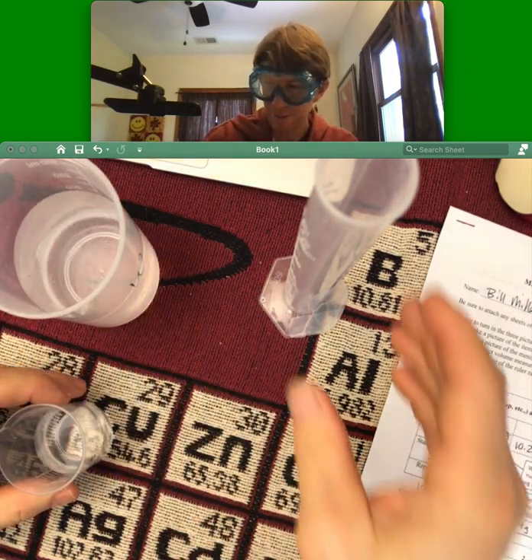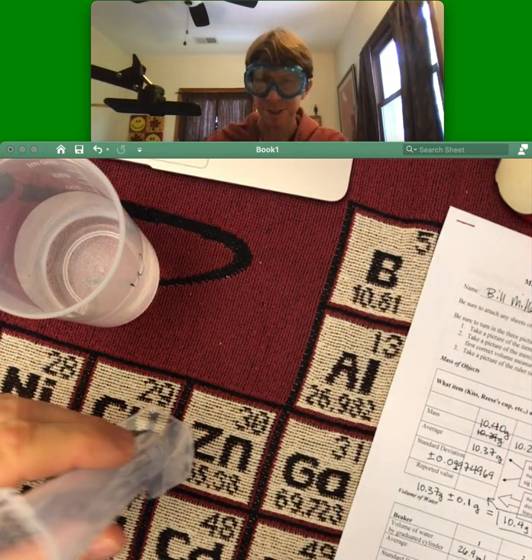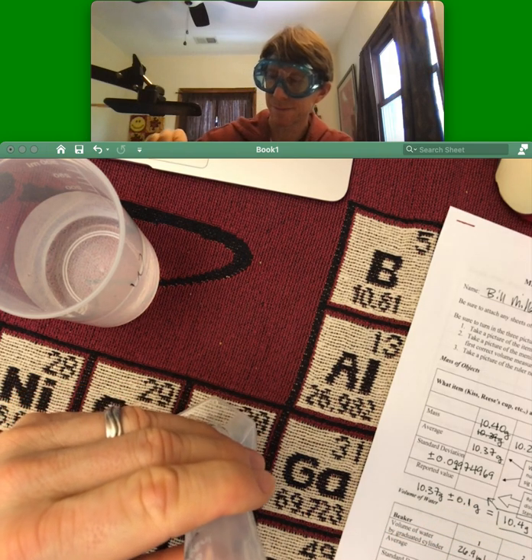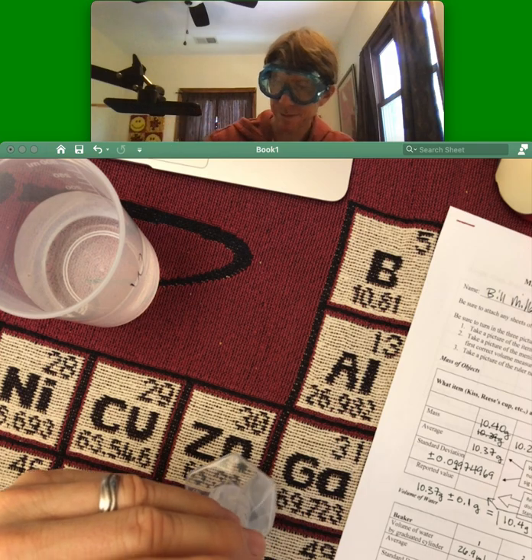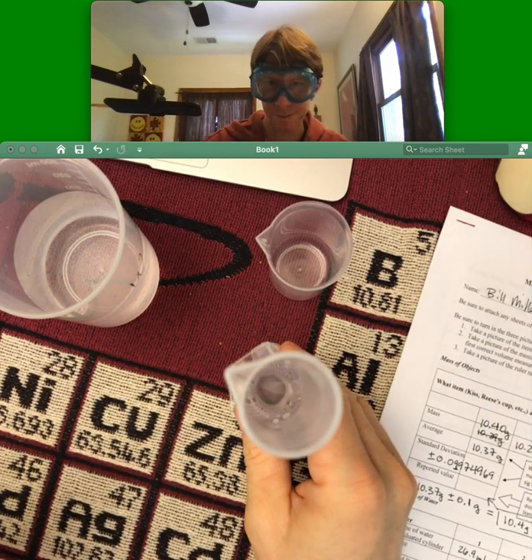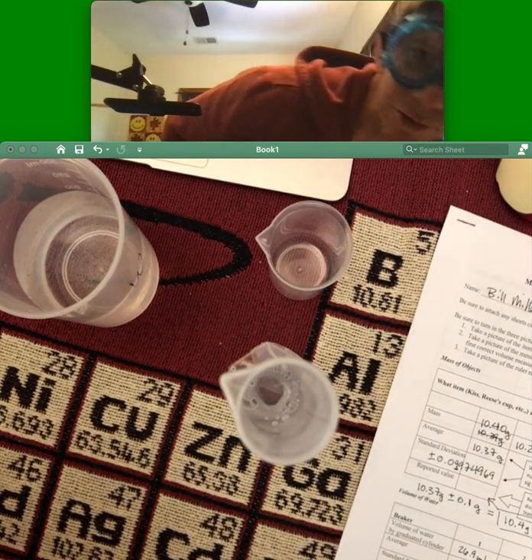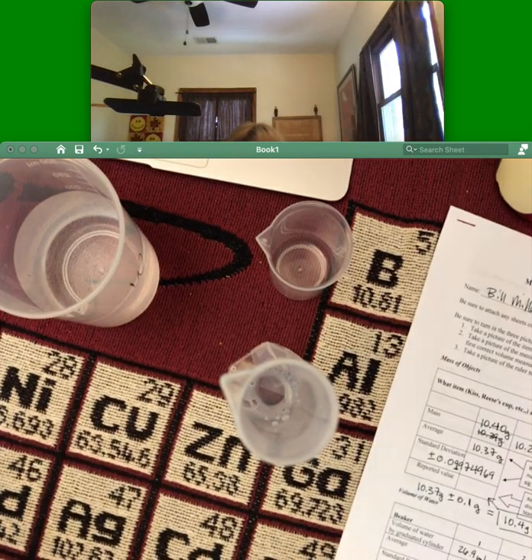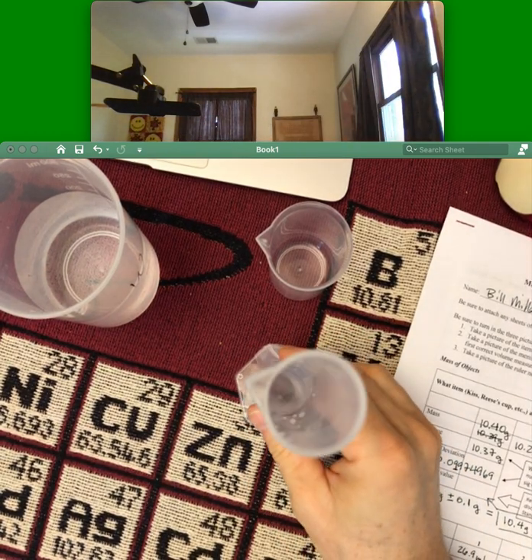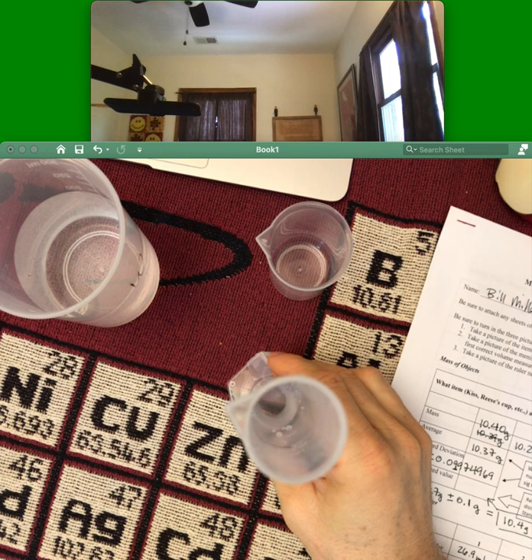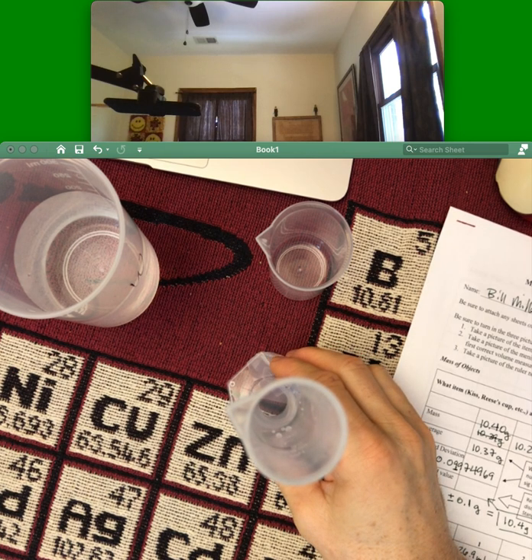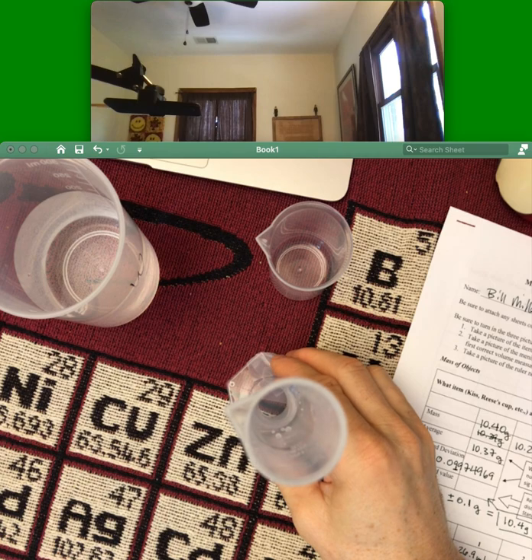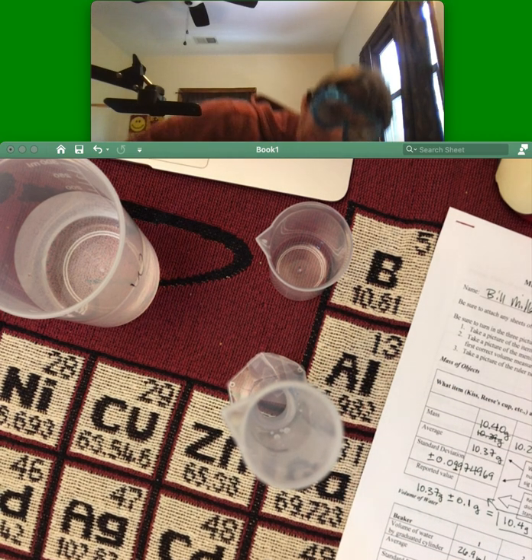And pour that into my graduated cylinder. And look straight across again. There's a bubble this time, so I just gave it a little bounce to get that bubble to go away. And looking straight across, I'm going to say 26.7.